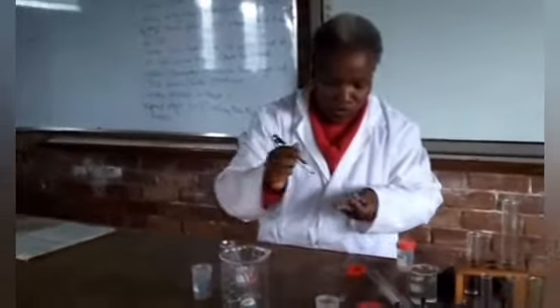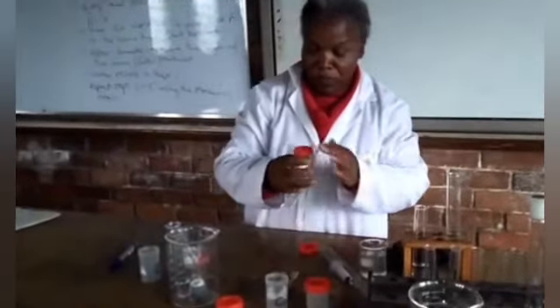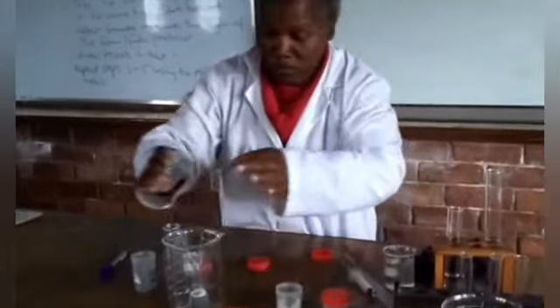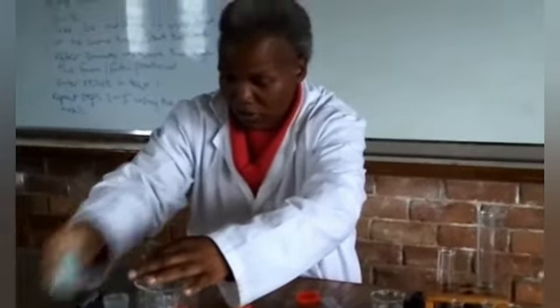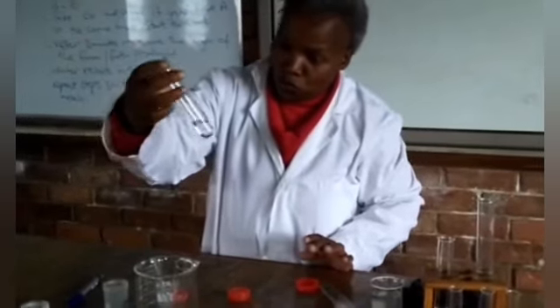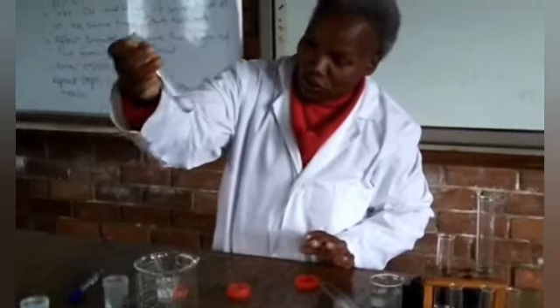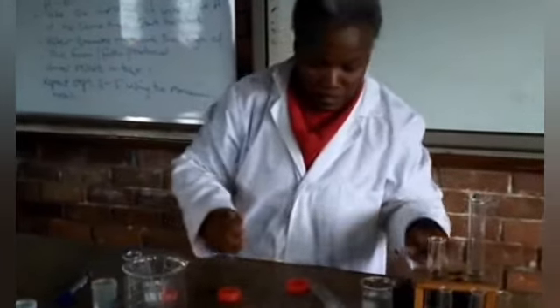Okay, so let's see, my 2 minutes are up. I'm going to add Pb, they are granules. I tried to weigh 0.25 grams of each element. So this is my lead.